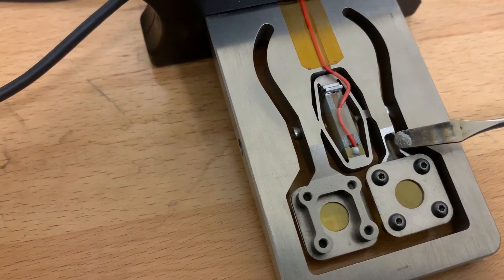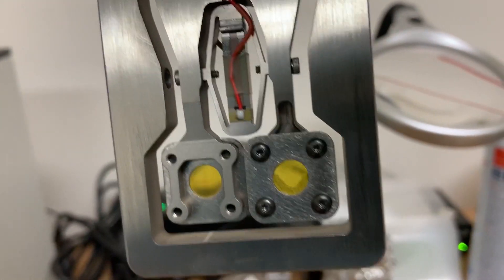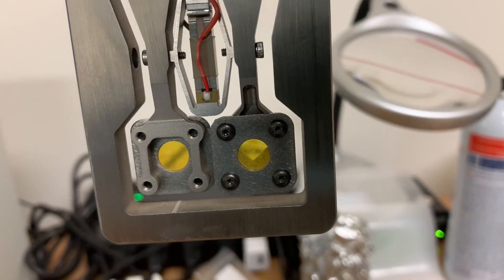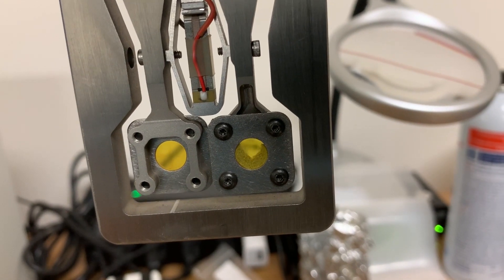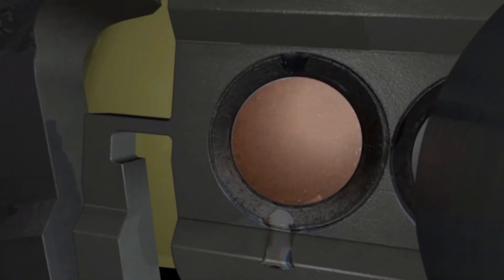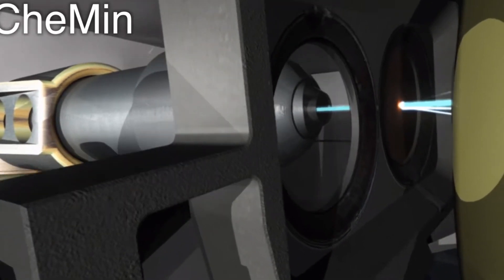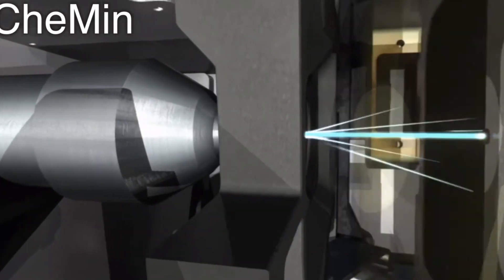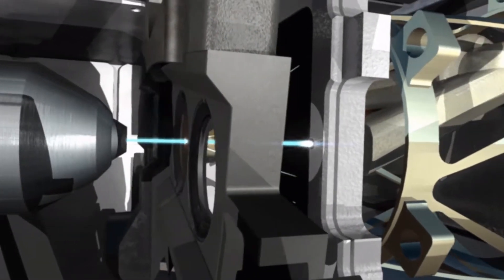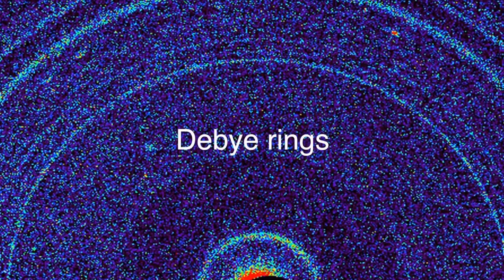We want all of the crystalline facets to be presented to the X-ray beam. The sample is moved into the path of the X-ray beam. The X-rays pass through the sample, scattering the X-rays onto a CCD, which generates a repeatable pattern of rings known as Debye rings. This is a measurement of the distance between the individual atoms that make up the crystal. This pattern is then searched and identifies the material.